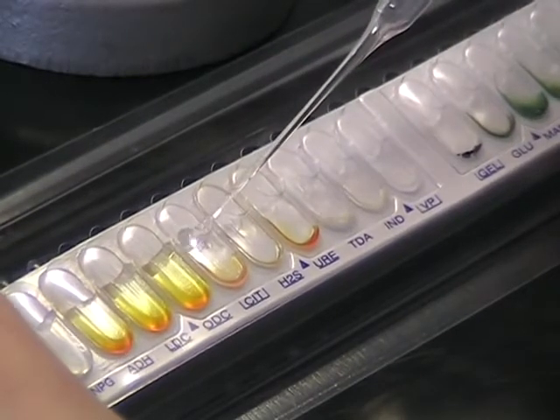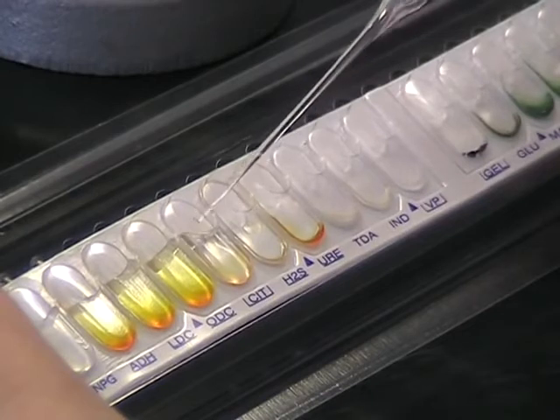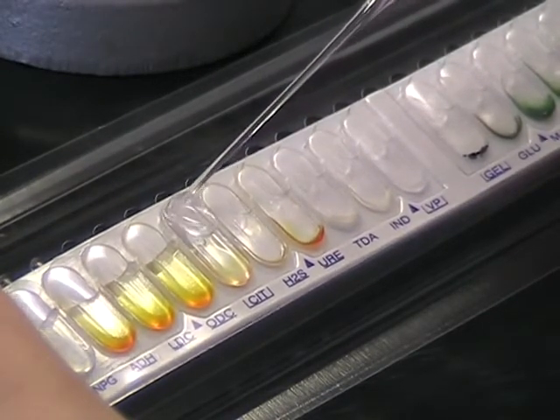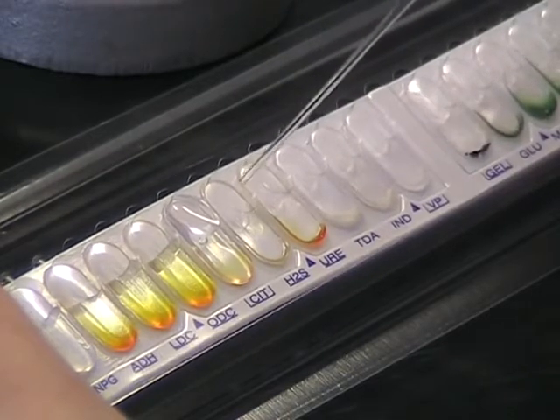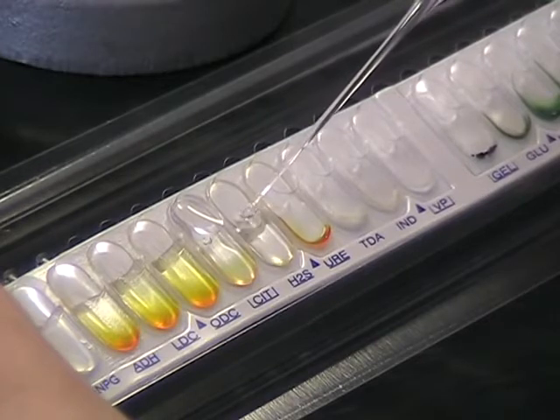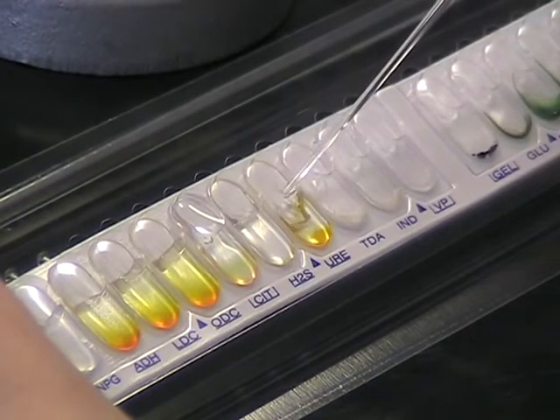The cupules with a little box underneath need to be filled up right to the top — for example the citrate cupule. The others just need to be filled to the lip of the cupule. Keep filling across the strip until all the wells are full.